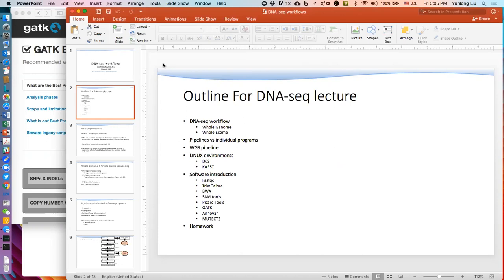And while this is happening, I'm not gonna stay just on the PowerPoint. We're gonna take a three-pronged approach to this. We're gonna go from the PowerPoint, we're gonna go to a browser window and pull up the software and talk about some of the things that go along with the software, because each of these packages is different and has different dependencies. You may find some challenges in running some of the software if you don't read the documentation and pay attention to what it needs to run. It will just tell you error messages and things have stopped and stalled. So you kind of have to figure out what's happening.